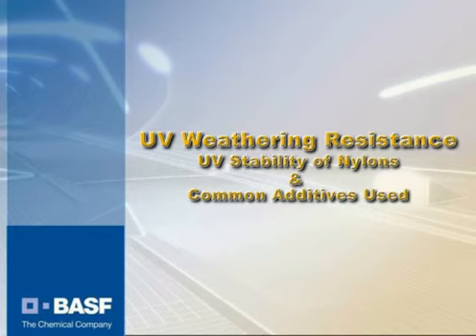Today, I hope to spend just a little bit of time to discuss UV weathering and the resistance of polymers to UV weathering, and how we go about accomplishing that, what type of equipment we use, and how that equipment functions. At the end of the presentation on UV weathering, we'll do a small basic touching on the UV stability, particularly of nylons, which is what this presentation is kind of geared around.